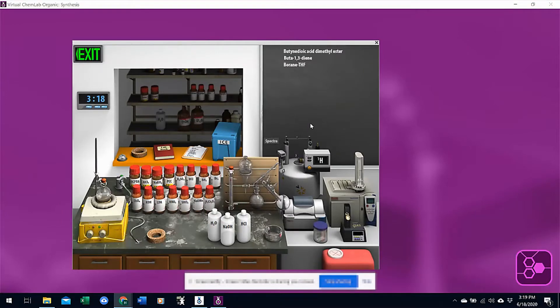I wanted to teach you how to save your lab book files and then how they'll be opened. Say you're in any of our laboratories — I'll show you in organic, but it works in any of them — and you've done something that you need to save to be able to send on to your instructor.